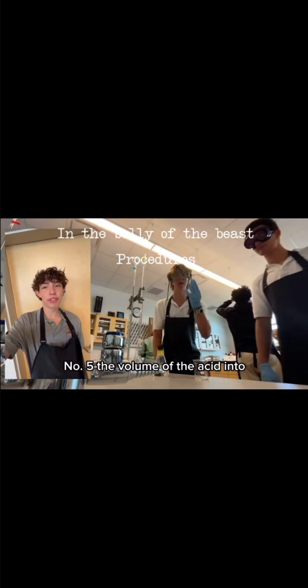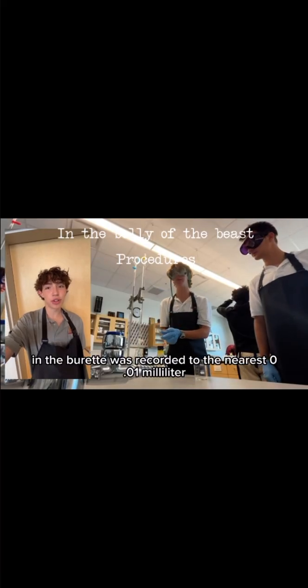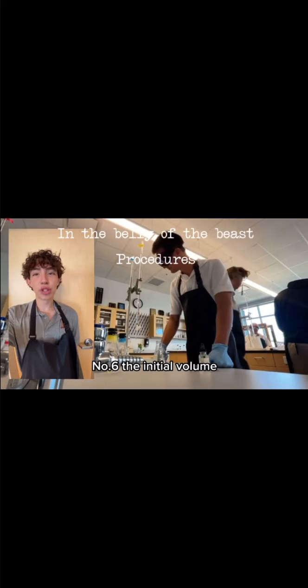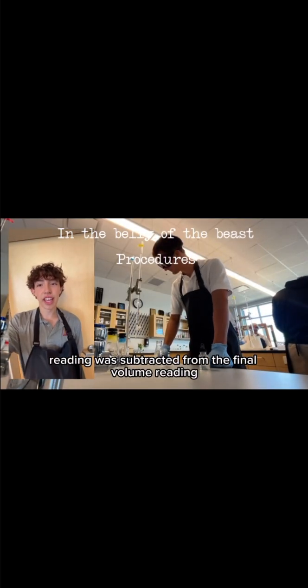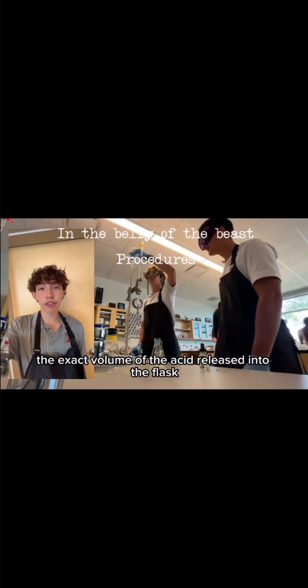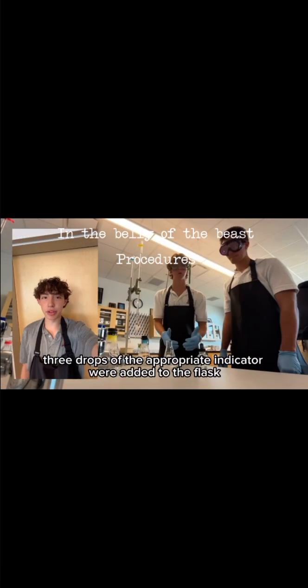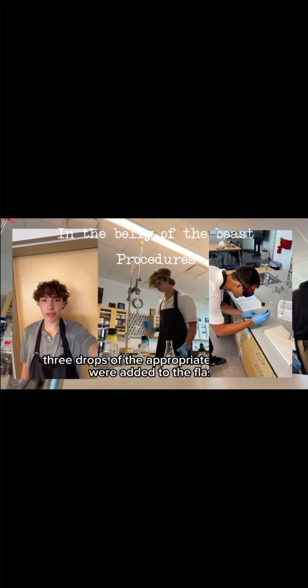Number 4. The 4.5 milliliters of acid was dropped into a clean Erlenmeyer flask. Number 5. The volume of the acid in the burette was recorded to the nearest 0.01 milliliter. Number 6. The initial volume reading was subtracted from the final volume reading. That was the exact volume of the acid released into the flask, recorded to the nearest 0.01 milliliter. Three drops of the appropriate indicator were added to the flask.